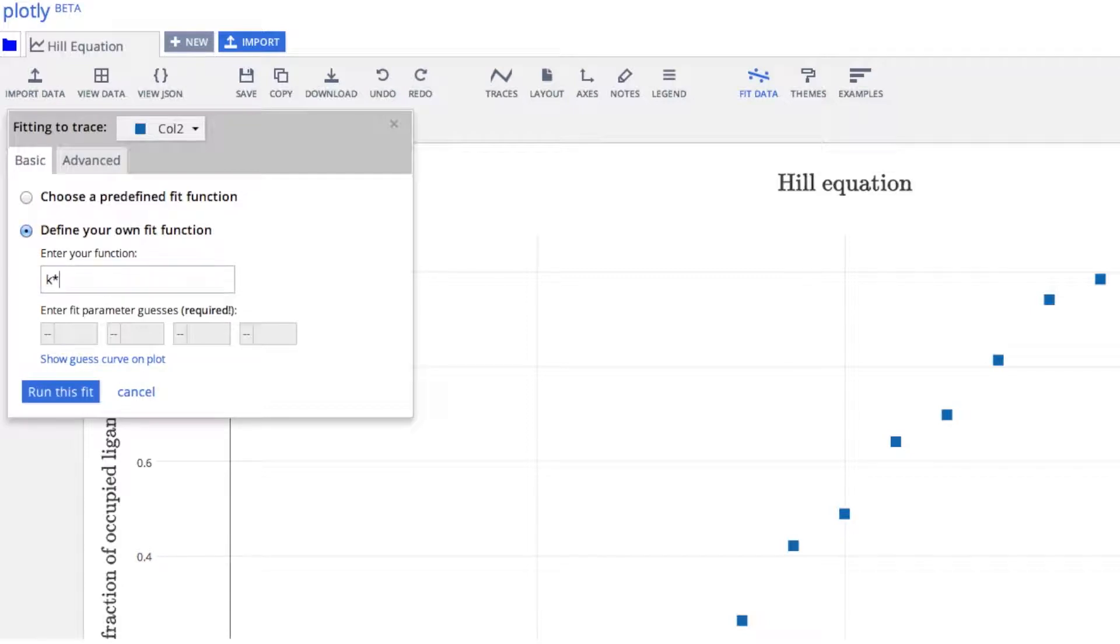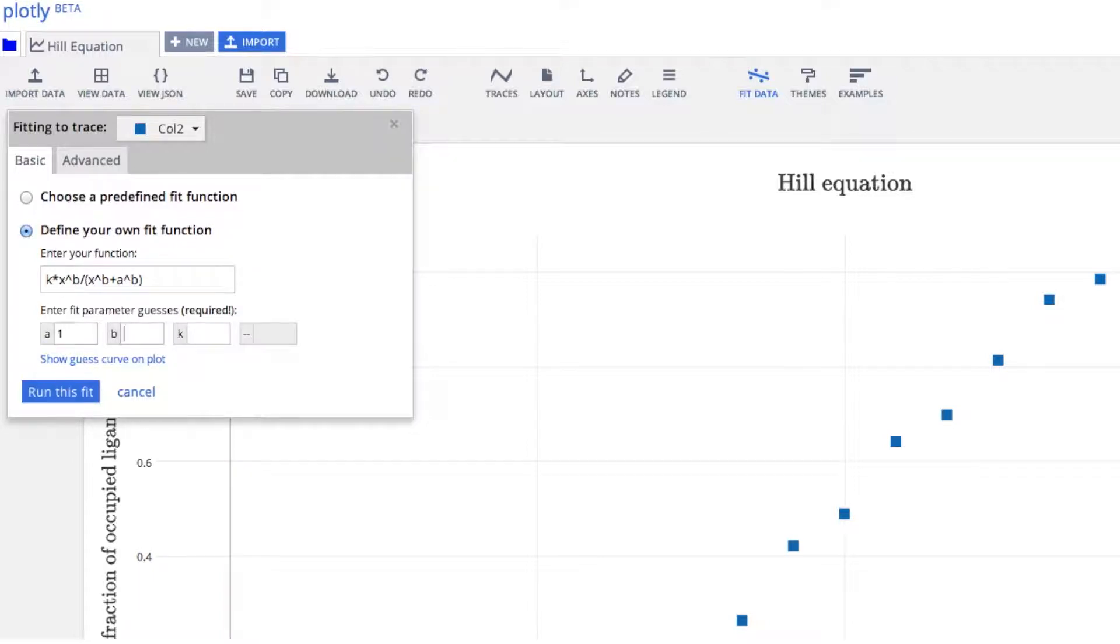We'll enter in the Hill equation, and the parameters of the function will appear below. For custom functions, you have to provide initial conditions.